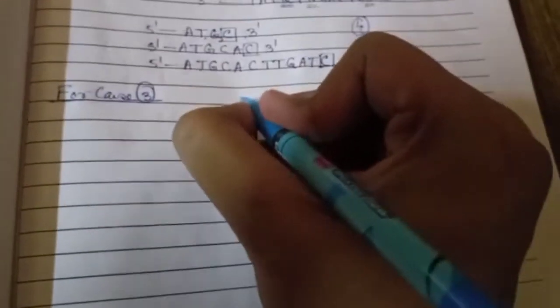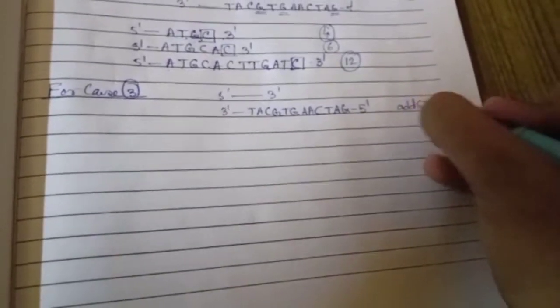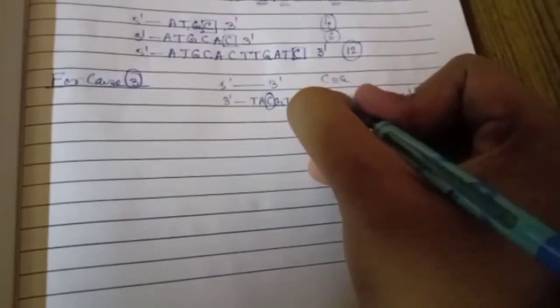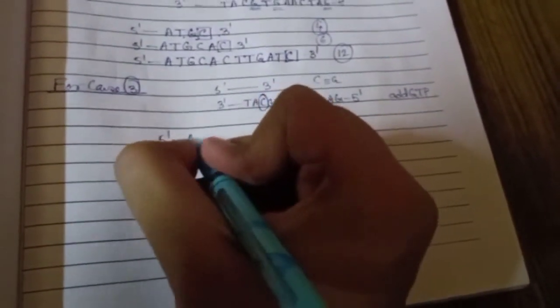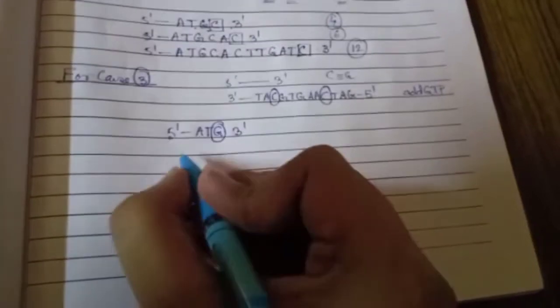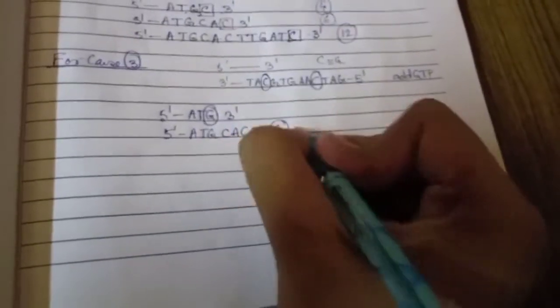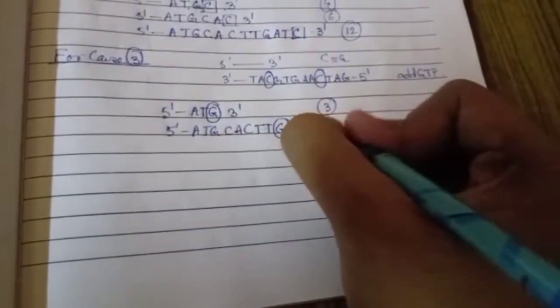And for case 3 or mixture tube 3, our DNA strand is TACGTGAACTAG, 3' to 5'. Here we add ddGTP, and we should remember guanine pairs with cytosine. So here ddGTP terminates at the position where cytosine is present. So we will get 3 nucleotide fragments and 9 nucleotide fragments.